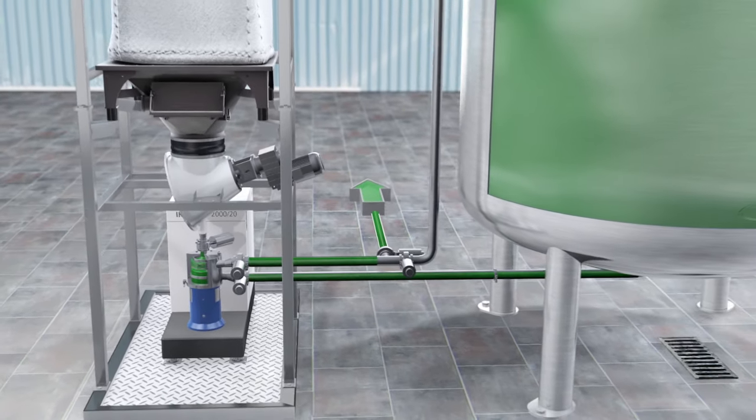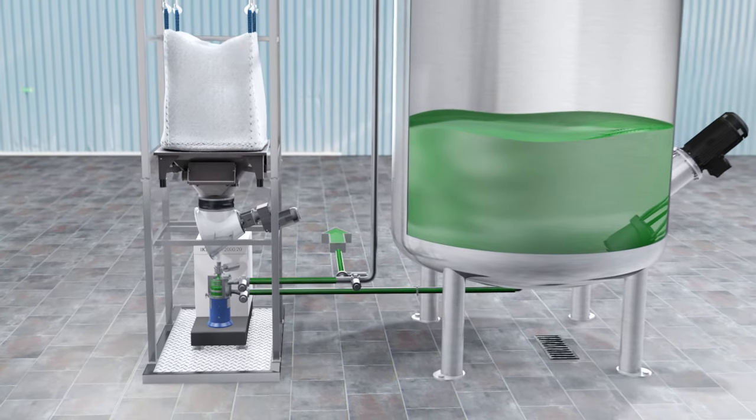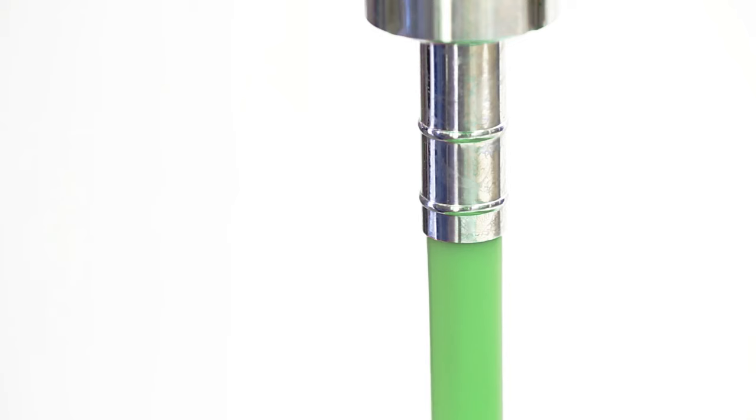Typically, the CMX will discharge the product without the need for ancillary equipment. The machine acts as a pump and conveys the contents of the vessel to the next process step.